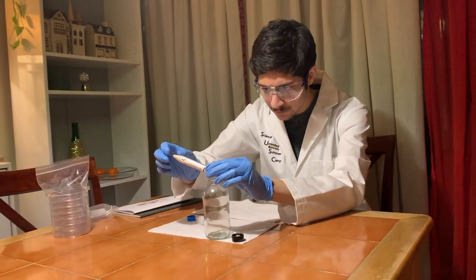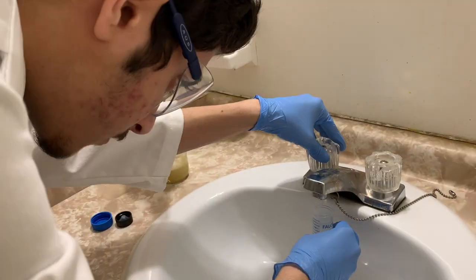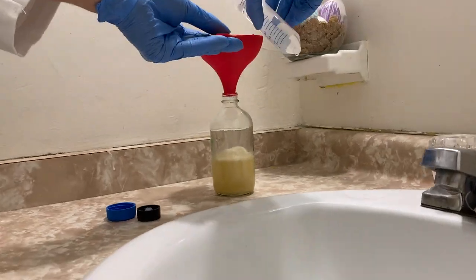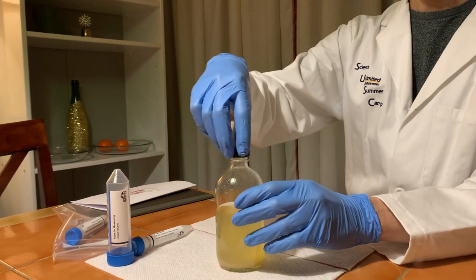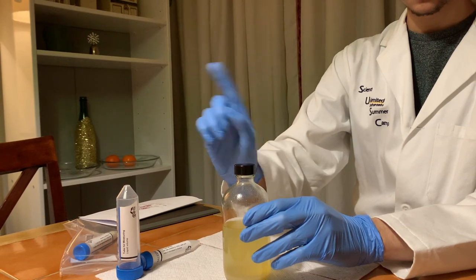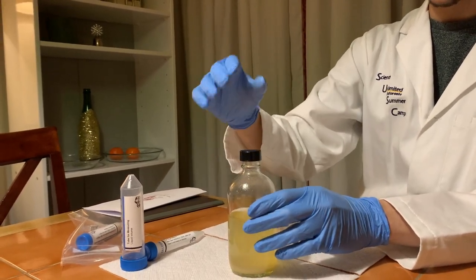First I had to make some petri dishes to actually grow the bacteria on. Right now you can see me here mixing some Luria broth powder with water, and this will eventually be the food for our bacteria while they're sitting in my fridge. Most people will just go ahead and screw the cap on tight, but this is not what you're supposed to be doing. Instead, you just place it on top of the bottle like this.